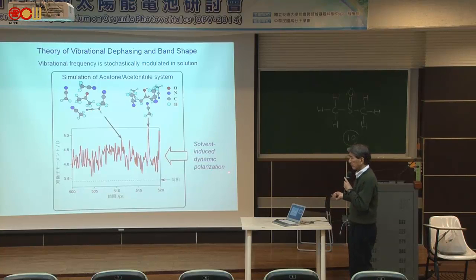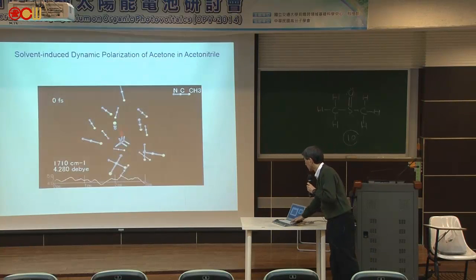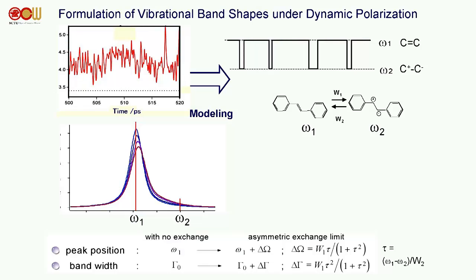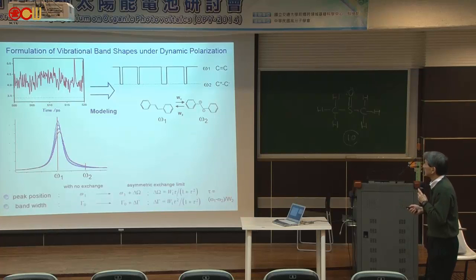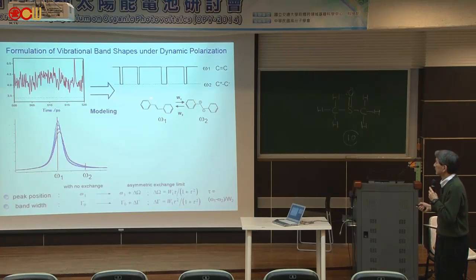Solvent-induced dynamic polarization. Okay, this is the same thing. And we used this concept to explain the relationship between the peak position and bandwidth we found for stilbene. And what we think here is that you have the double bond in the S1 state.